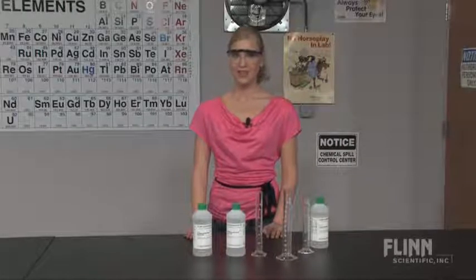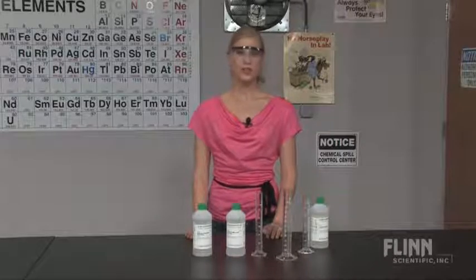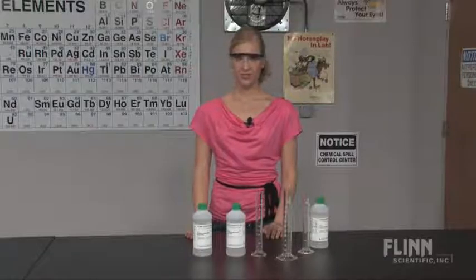Volume, however, depends on the interactions between molecules and the spacing between them. Show your students with two demonstrations that volume is not always conserved.